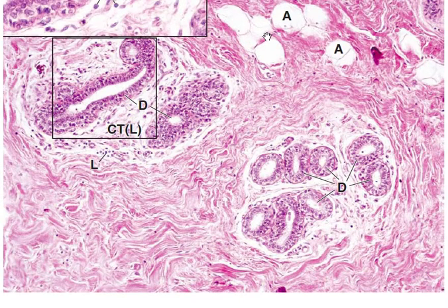The epithelial cells within the resting lobular units are regarded as being chiefly duct elements. Usually alveoli are not found. Their precursors, however, are represented as cellular thickenings of the duct wall. The epithelium of the resting lobule is cuboidal. In addition, myoepithelial cells are present.